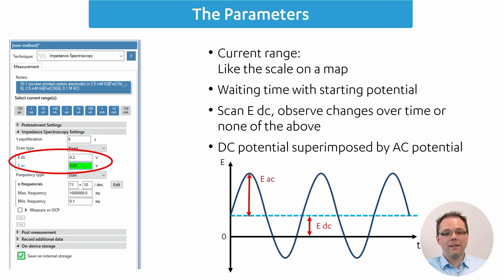The next two options are the EAC and EDC, and they basically define where your sine wave is and how it looks like. During an impedance measurement you apply an EDC, so a constant potential, and you superimpose on that an EAC, so a sine wave shaped potential.